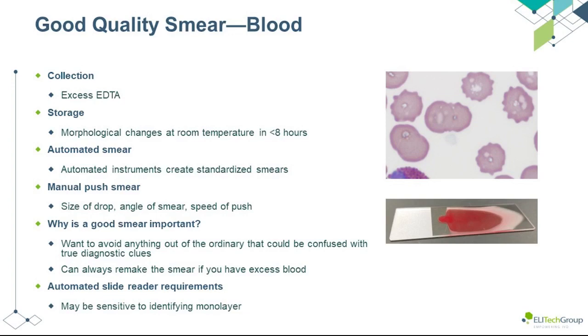If you've made blood smears before, you know that without practice, it can be difficult to consistently give perfect smears. If you work in a large enough laboratory, perhaps the instrument makes the smears for you. But there are also really helpful benchtop devices that can perfectly make consistent slides every time. I'd suggest getting one of these if making smears by hand is a problem. We might ask ourselves, why is a good smear so important?